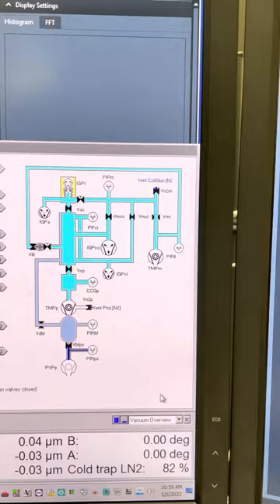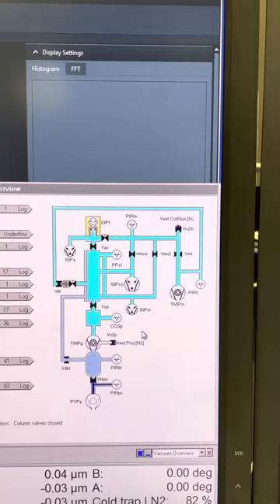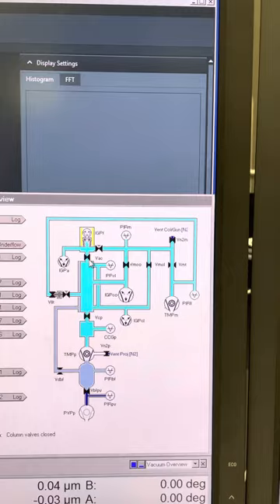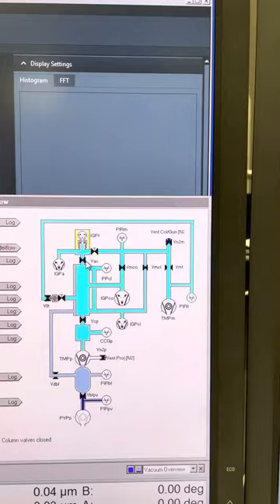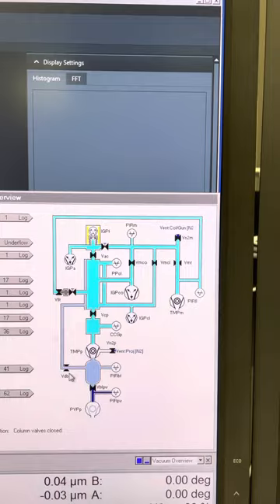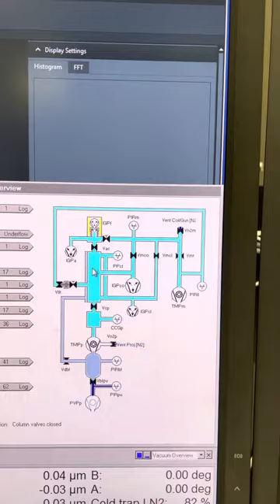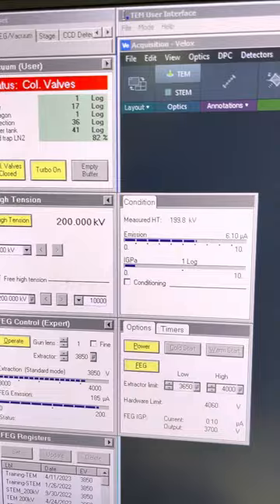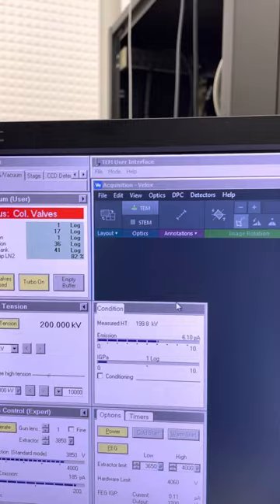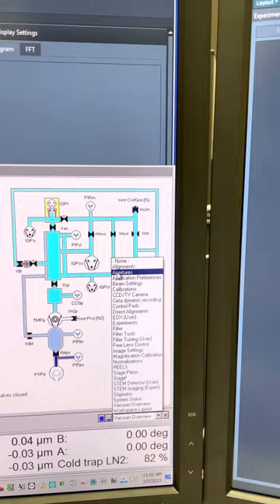You can also pull out the vacuum overview window, which gives you an idea about the vacuum. The lighter the blue, the better the vacuum. You see those tie ball symbols here which represent the column valves, and they are now closed. For example, this is how it looks like when the valve is open, but the column valves are closed, which makes sense because the column valves button is yellow. Make sure the vacuum is good, column valves closed button is yellow, and make sure the objective aperture is retracted.